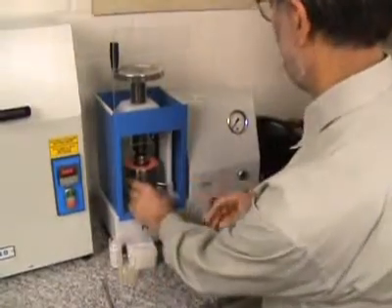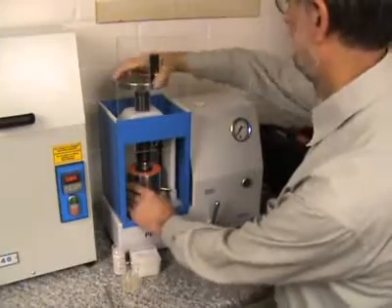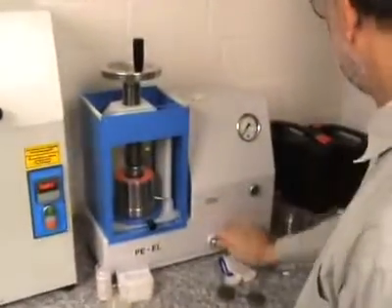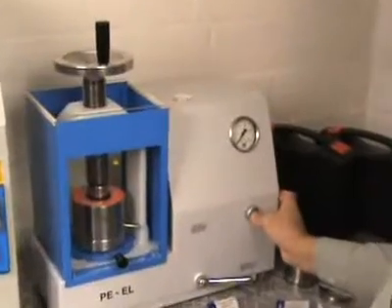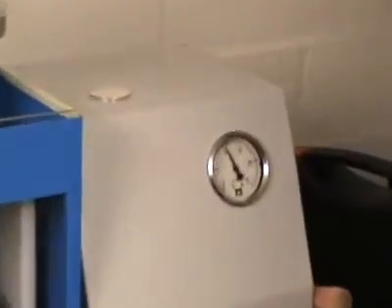The die set is placed into the electro-hydraulic press. The safety window is closed, the valve is shut, and now the electro-hydraulic press moves up to 18 metric tons.